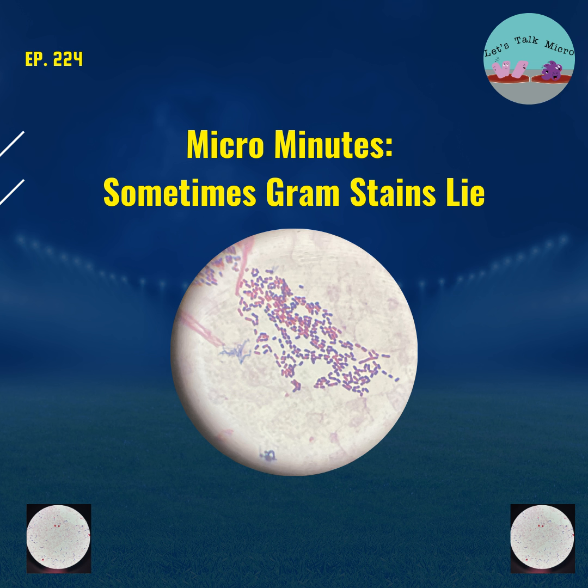Well, today's episode is titled Sometimes Gram Stains Lie. I will be talking a little bit about Gram stains and some things that you should know, and ultimately that will help you do your job better at the bench.